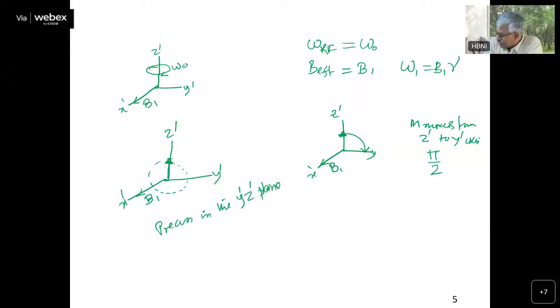That is nothing but an angle of pi by 2. It depends on the B1 and how much time you apply it.